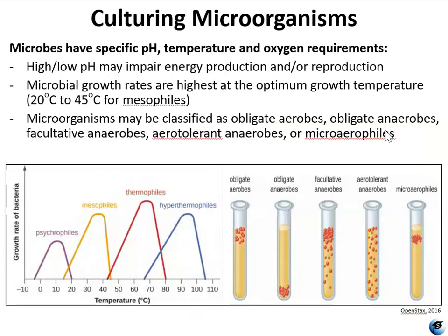As you've seen already, and also throughout the rest of this course, we're going to be culturing and growing bacteria. And it may seem kind of counterintuitive to want to grow bacteria because you're used to wanting to kill it. But microbiologists, in order to study microbes, have to first grow them out. And in order to do that, you must be mindful of their specific pH, temperature, and oxygen requirements.